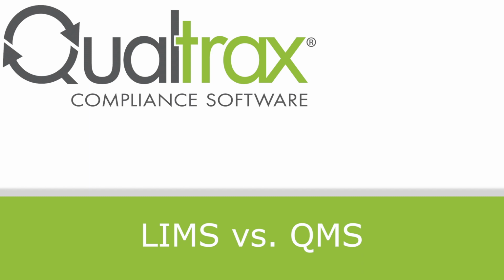Any question of impropriety can be costly not only in money, but in the form of lawsuits for questionable samples, as well as the loss of time and earned revenue to earn back the respect and credibility of the laboratory. Sometimes these labs cannot recover at all, causing loss of services to the community along with loss of jobs. If this information is not being controlled by a laboratory information management system and a quality management system, it can leave your laboratory vulnerable. Employees could delete test results and/or procedures inadvertently, use wrong versions of procedures, and put your laboratory and its results in jeopardy.